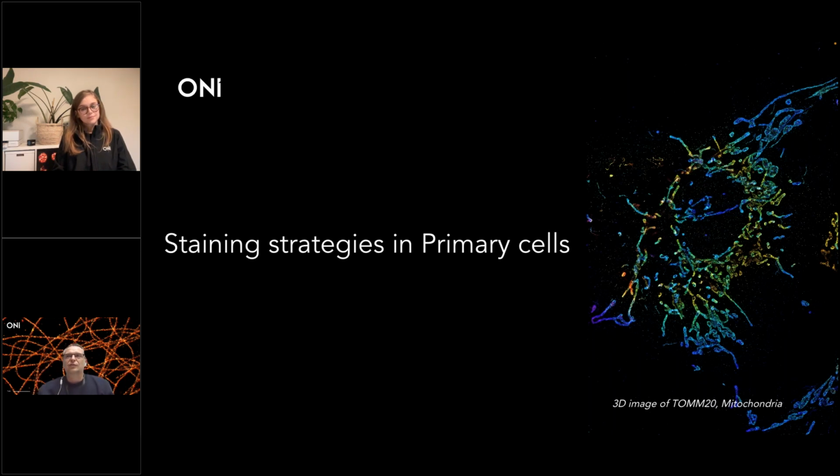And that will lead to different subsets of T cells from them, for example. So in this case, if we go a little bit deeper, what type of results could you expect? If you are working with primary cells and you have a lot of them and you expand them, you can optimize your staining on those primary cells. But don't be surprised if you take another donor and the results are slightly different. Really, don't be surprised. That's very commonly happening. That's why I would recommend taking at least 5 different donors.